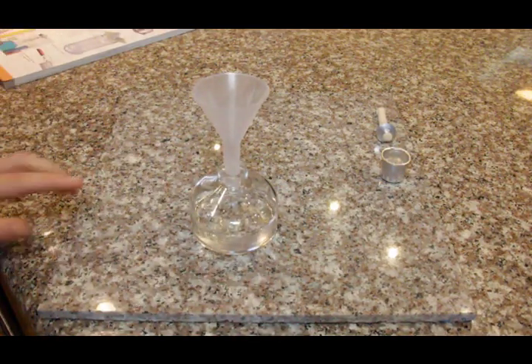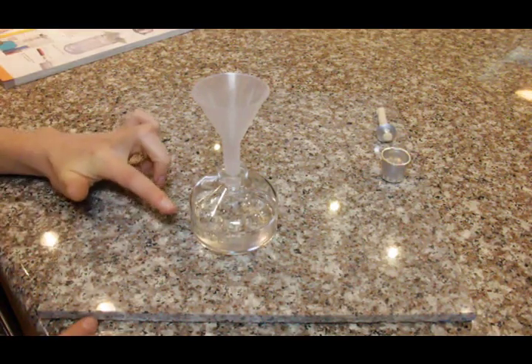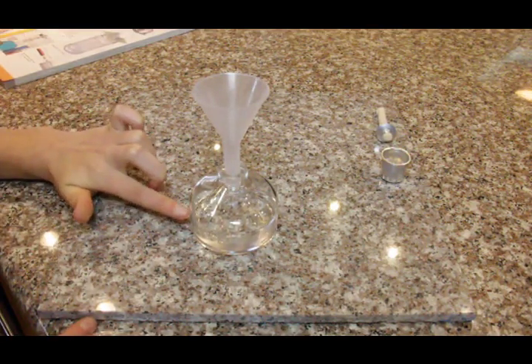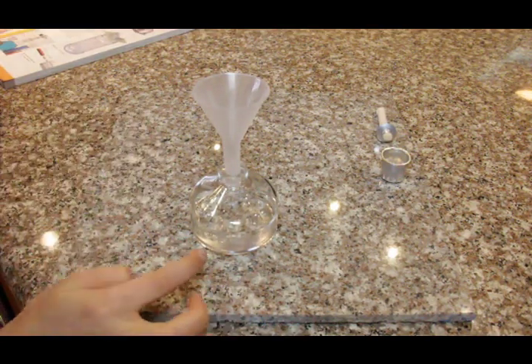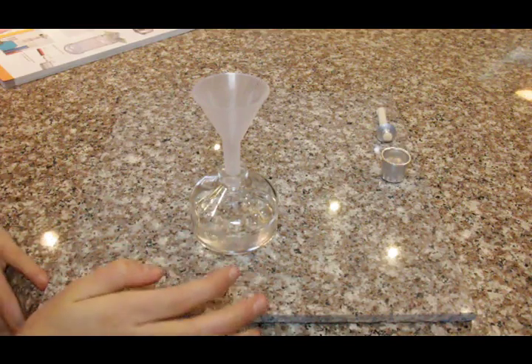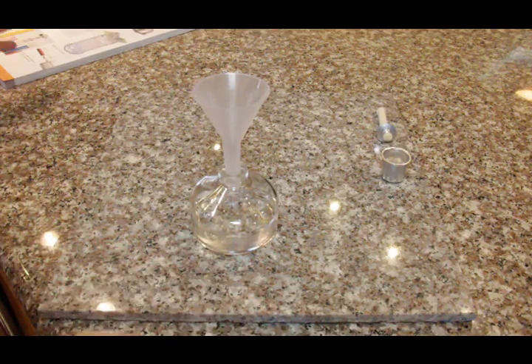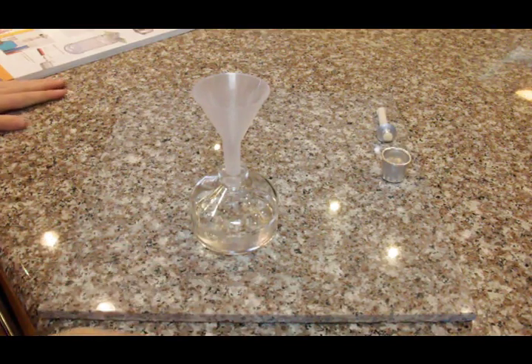As you can see, this is the max fill line. On this burner base, it says max fill line. So it's very simple.